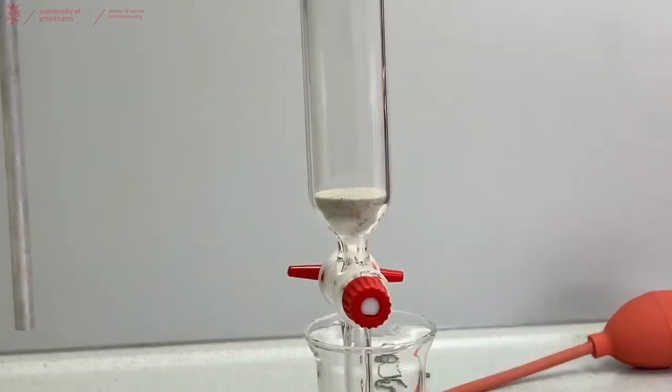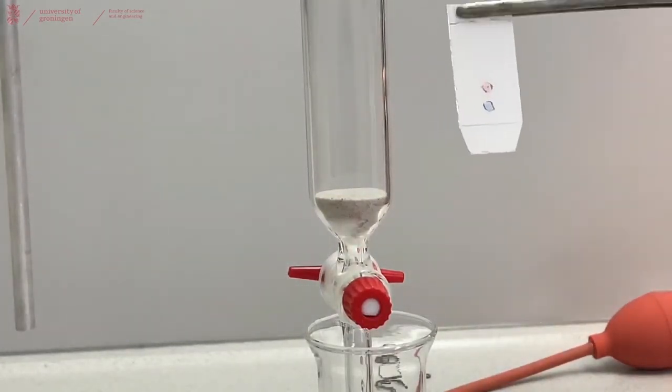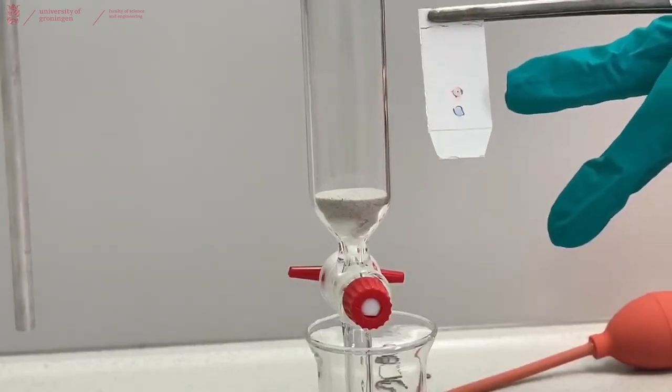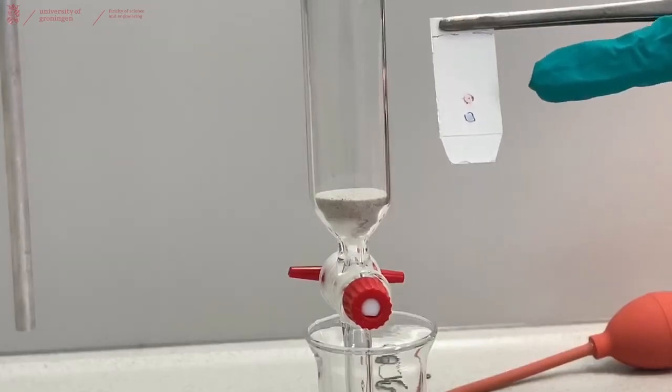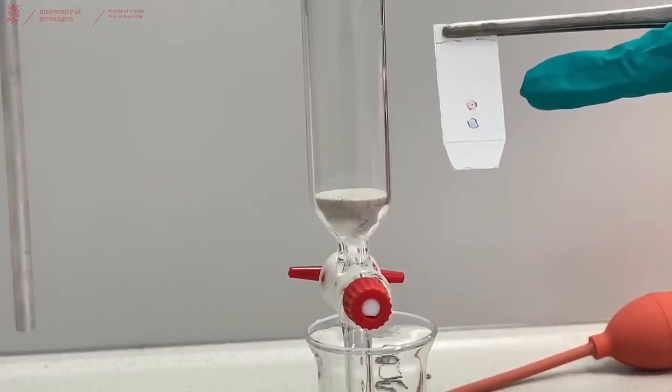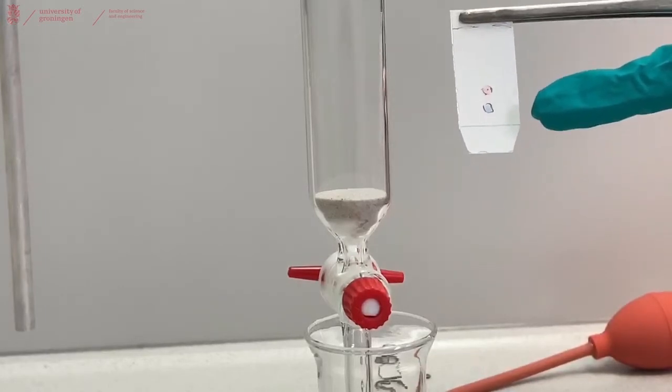Now that we have prepared this, we can continue to prepare the rest of the column. But before doing that, make sure that you check by TLC that your product that you want to isolate is at an RF value of around 0.3 in the eluent that you want to use. In that case, it's the red spot or the top spot for those that are colorblind. And the blue spot is at the bottom, and that is our impurity that we don't want.